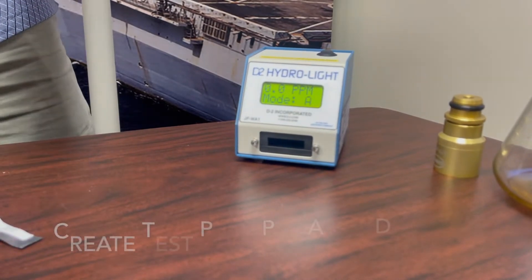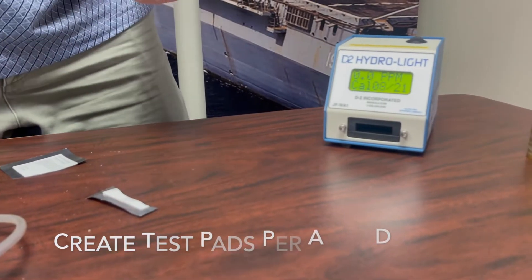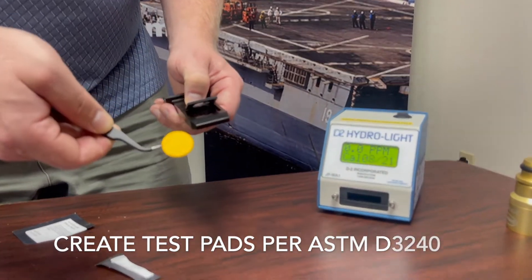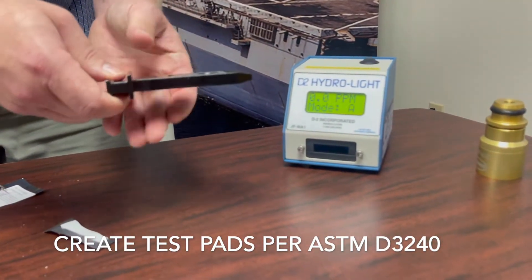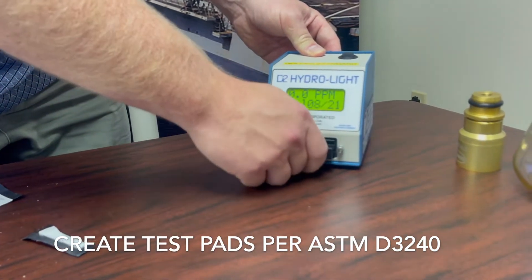Always following ASTM D3240, once your instrument has been verified that it's working within the proper range, a fuel sample can be passed through a test pad. We're using an unused test pad for demonstration purposes. The pad is placed carefully using tweezers into the test shuttle, which is inserted into the instrument.